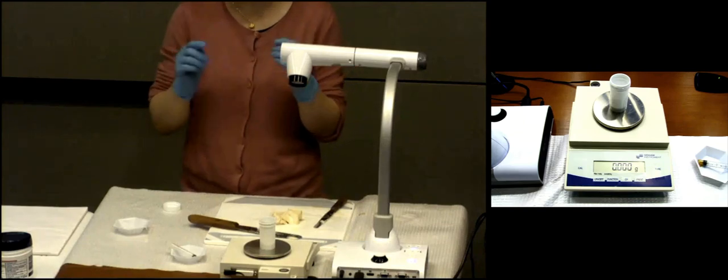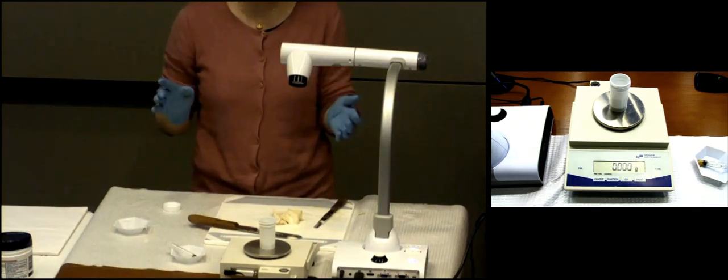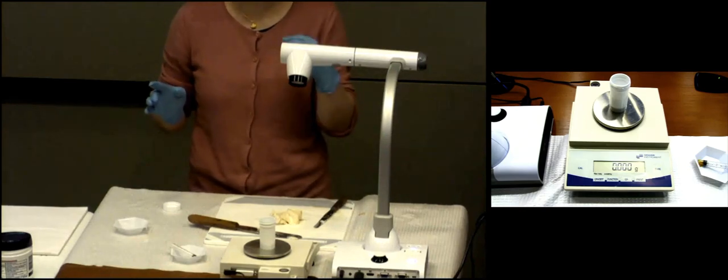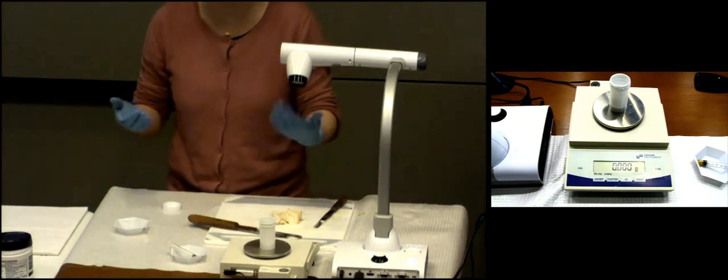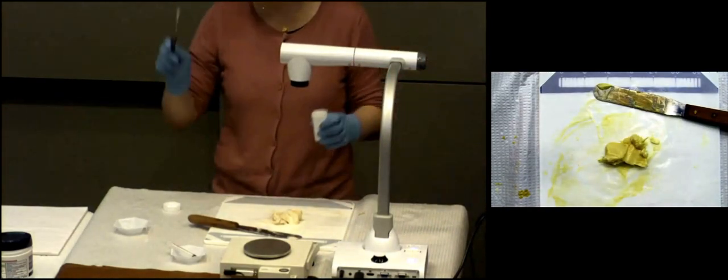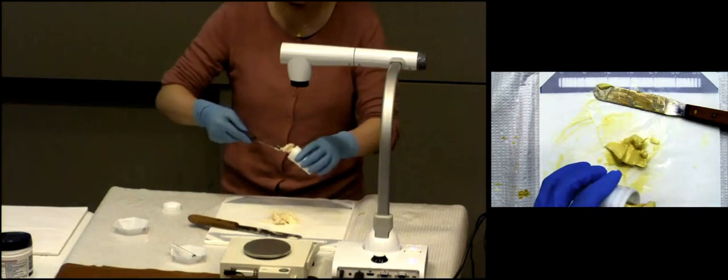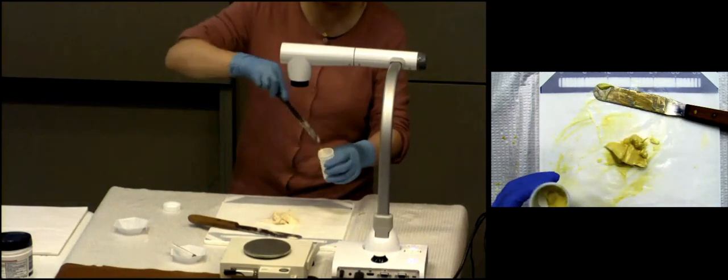You can tare without the lid or with the lid. Either way is fine. If you tare without the lid, you measure without the lid. If you tare with the lid, you measure with the lid. So either way is fine, okay? All right, so at this point, you want to use your small spatula to take a small chunk, okay, and add it into your bottle.